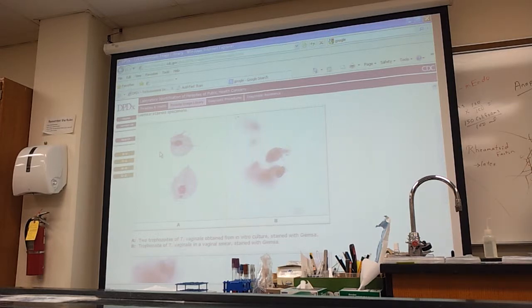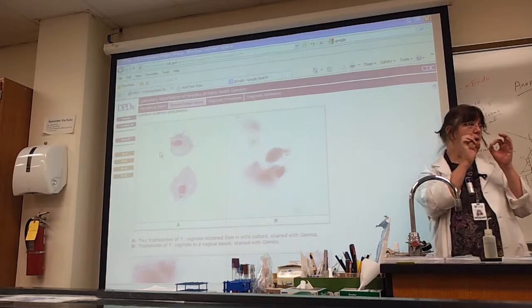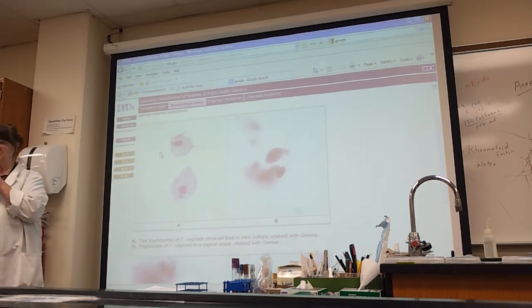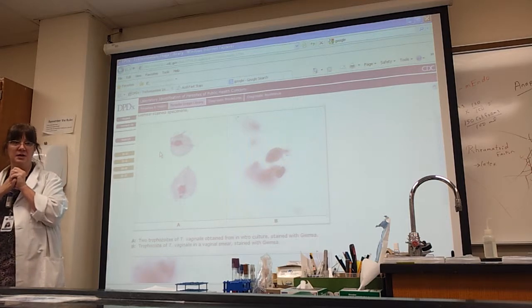Okay, the next one's fun. What if he's looking back at you? Who was that? Giardia. Then there are eyeballs. Please don't tell me they're eyeballs. They are equally sized nuclei. What type of disease does he give you? Diarrhea. Here's your diarrhea.